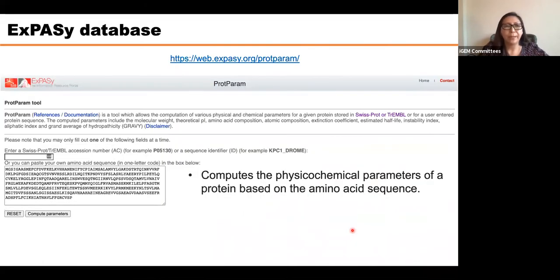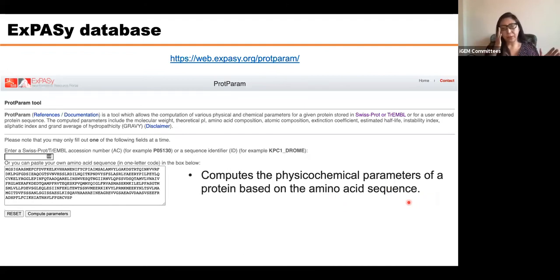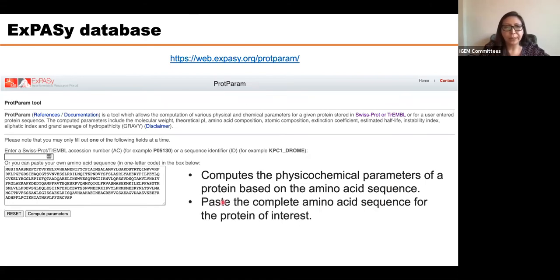This is why I'm presenting the database called ExPASy. It's the database I like, though there are many others. In this database, you can compute the physical-chemical parameters of a protein based on its amino acid sequence. You get the primary structure sequence of your protein, paste it into the provided space, press 'compute parameters,' and you get a list of physical-chemical parameters for each protein.